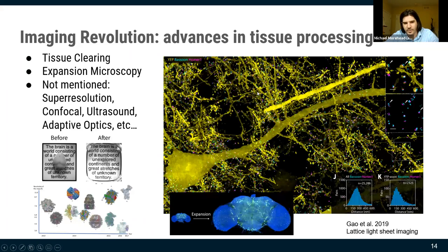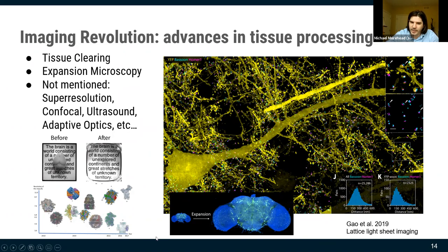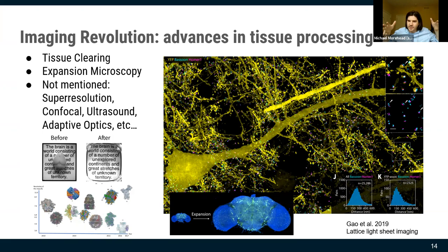With expansion microscopy, swelling the brain proportionally helps because your imaging tool's light waves go farther, effectively giving you better resolution.